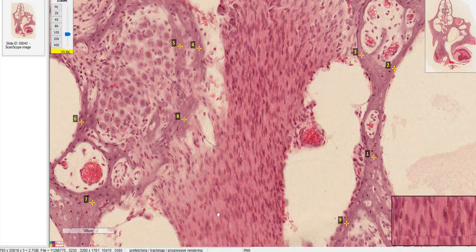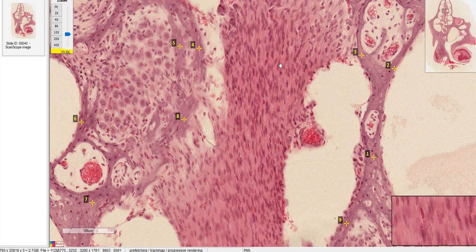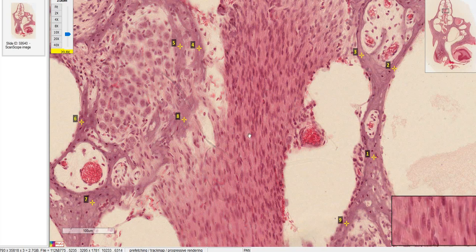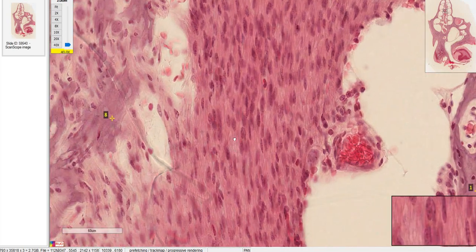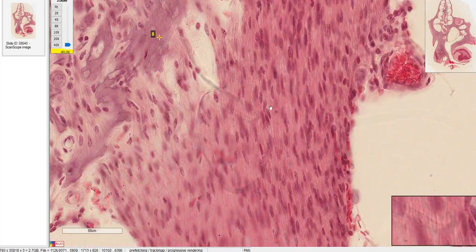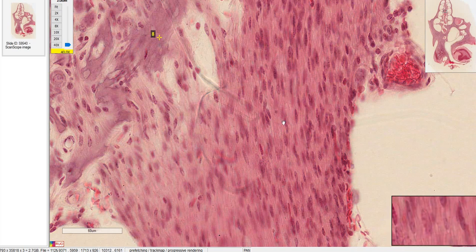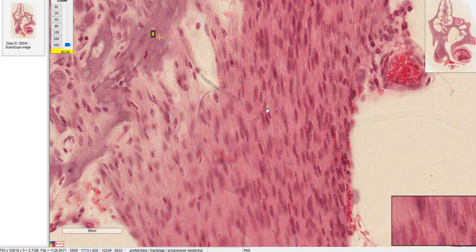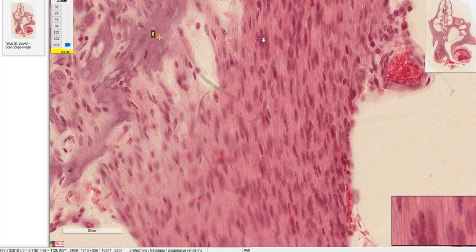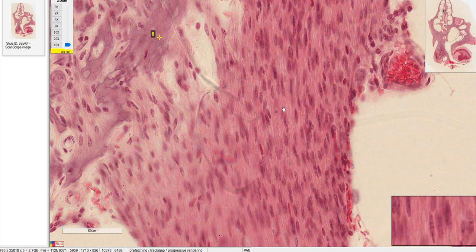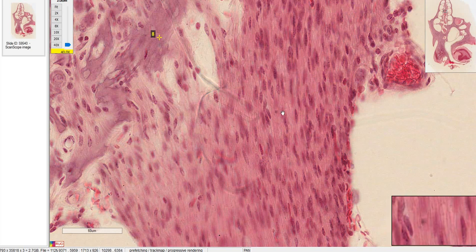Now let's talk about this large central structure. If we zoom in a bit, you can see these fibers running up and down — this is actually the cochlear nerve. It's not bone. These nuclei are Schwann cells.